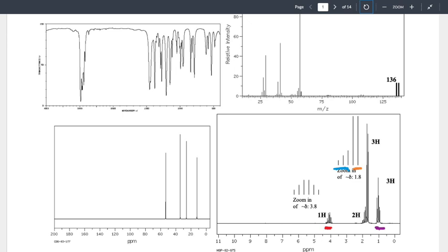So really all the NMR can tell us is the ratio. For every one of these, I get 3 of these. That could mean in my structure, I have 3 and 1. So my structure could be something like this. 3 hydrogens all identical, 1 hydrogen different from it.